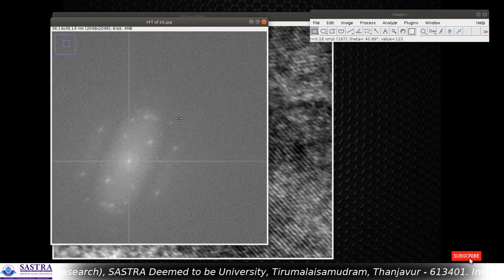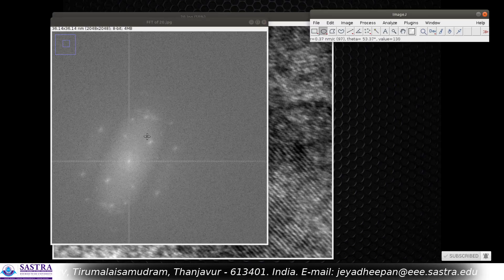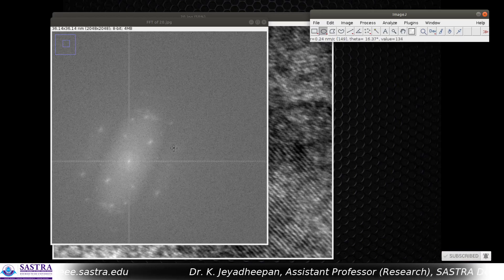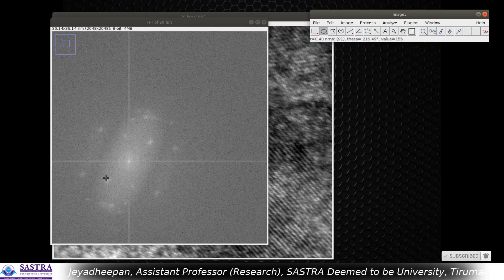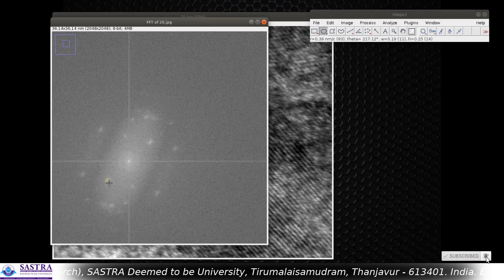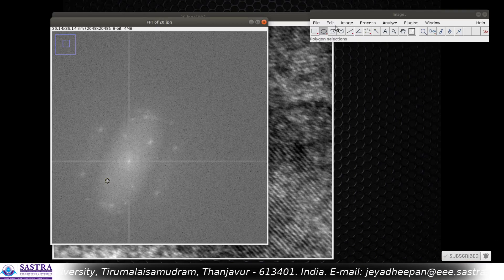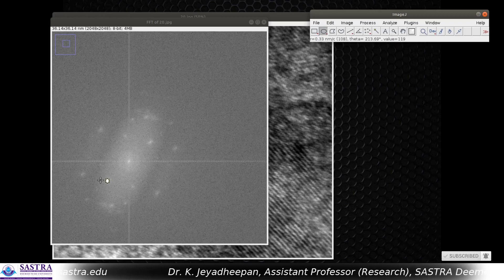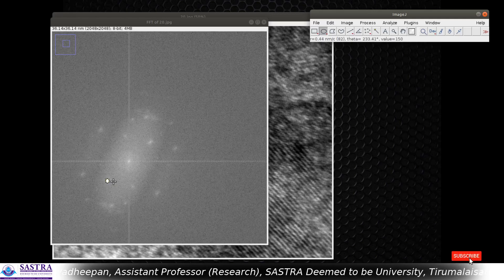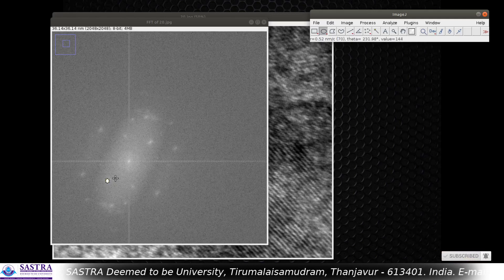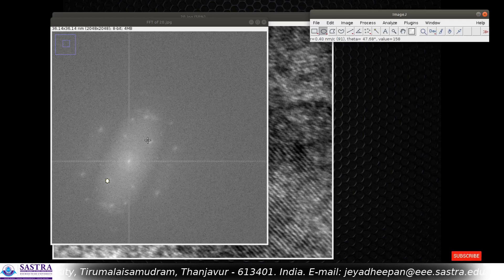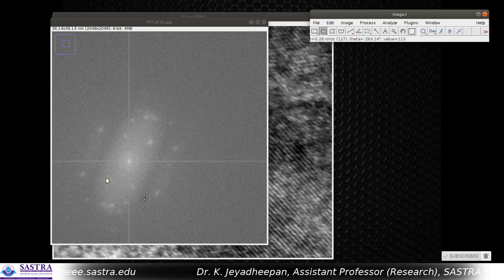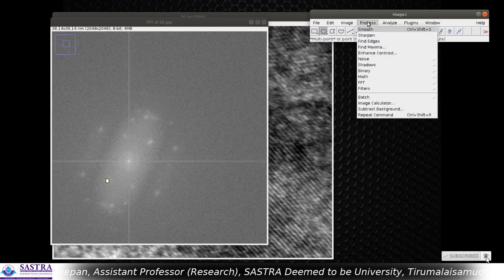For the visual method, go to the Oval tool and select any of the bright spots in the FFT pattern. You just select the brightest spots using the oval tool, then go to Edit and press Fill. Now you have masked the area where that particular spot was. You might ask why we can't take other points — I'll explain that later.